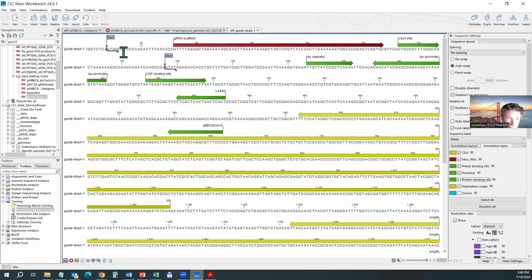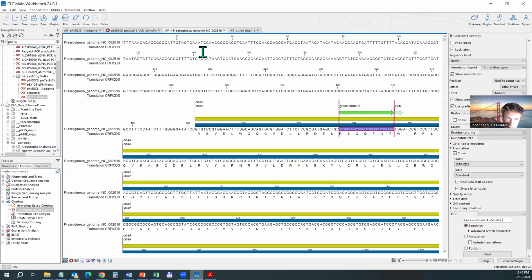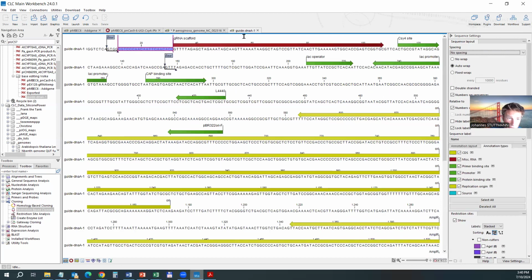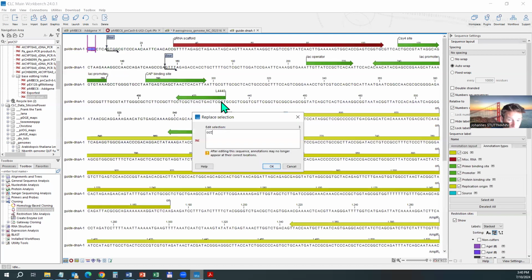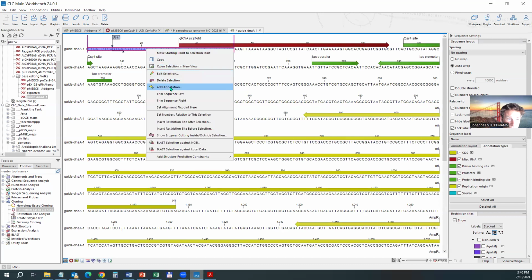Okay, so here I now have my guide RNA sequence pasted. From everything that I said about cloning before, here we already have the right overhang. We have a BsaI site. So maybe we want to add like 2 T's in front. So this would be my first PCR primer, basically. I just have to add now something that can make it hybridize on the template. So let's take these 20 nucleotides. So my PCR primer would be all this.